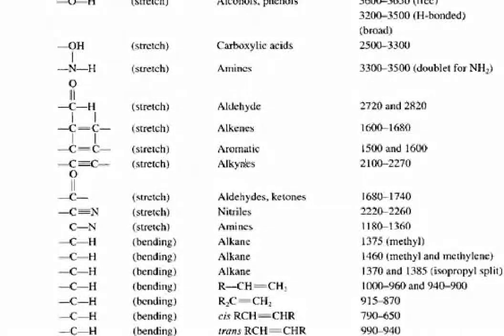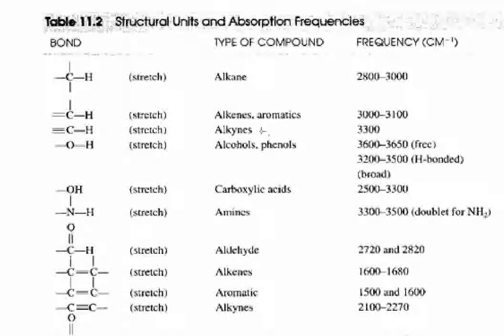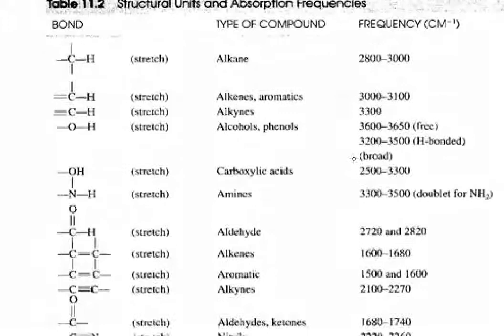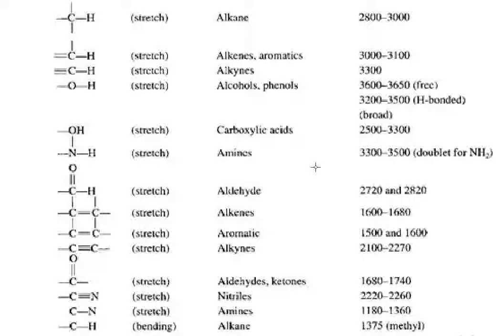Alkenes and aromatic compounds are related. In fact, let's go back up to the entry for alkenes. I forgot to mention that this entry has two functional groups, alkenes and aromatics, because the CH stretch for both of them occurs in the same place, 3,000 to 3,100. If you have an IR spectrum and you see a peak between 3,000 and 3,100, you couldn't immediately say whether it was an alkene or aromatic.